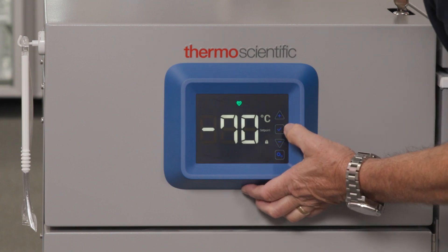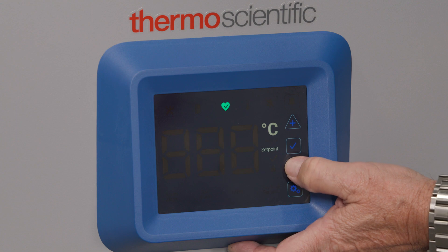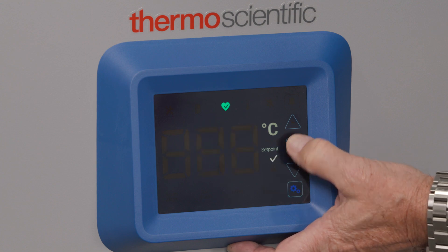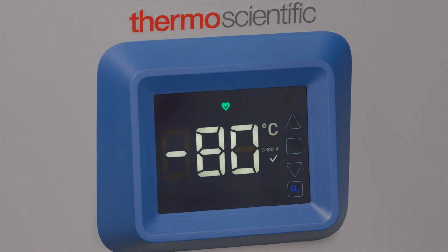To modify the control temperature set point, press the plus or minus button while displaying the unit temperature. The control setup is displayed. Adjust the set point to the desired temperature and select the check mark button to save the new control set point.